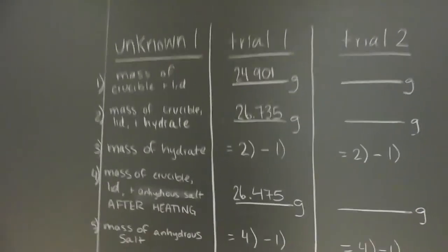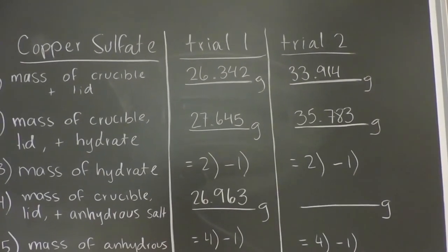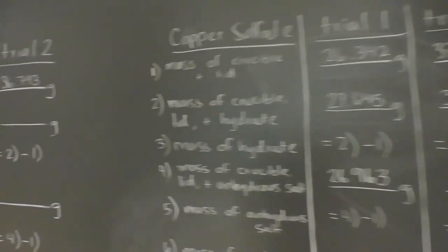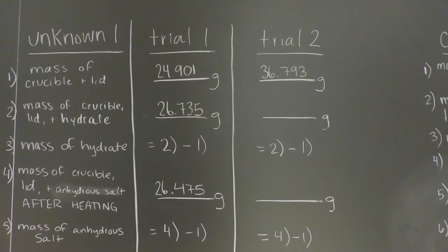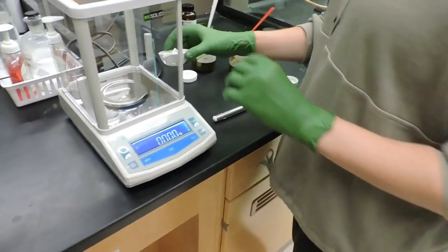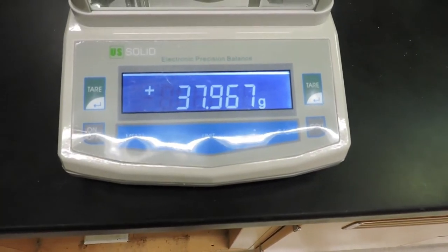We will repeat this experiment for the unknown in an additional trial, as well as an additional trial for the copper sulfate. We started the second trial with the new crucible, reweighed at 33.914 grams, with the sulfate, 35.783 grams. For the unknown hydrate, we've also used a new crucible, with 36.793 grams being its mass. And then of course, we'll add more unknown hydrate to the crucible, between 1 and 1.5 grams, for a total of 37.967 grams.